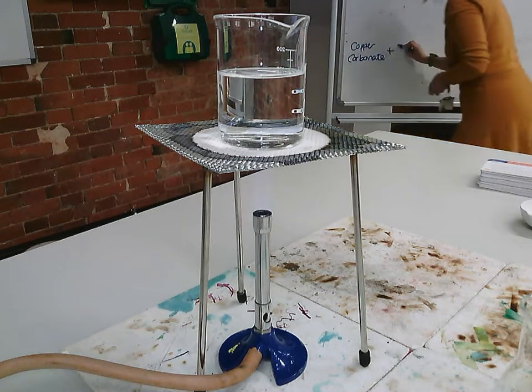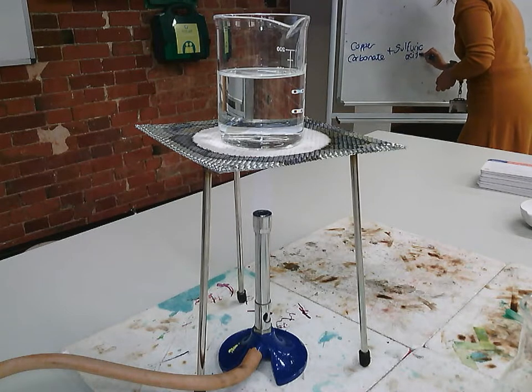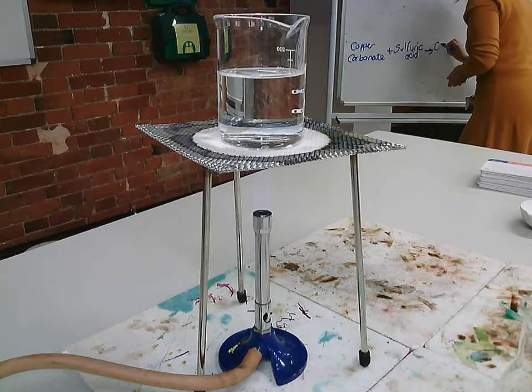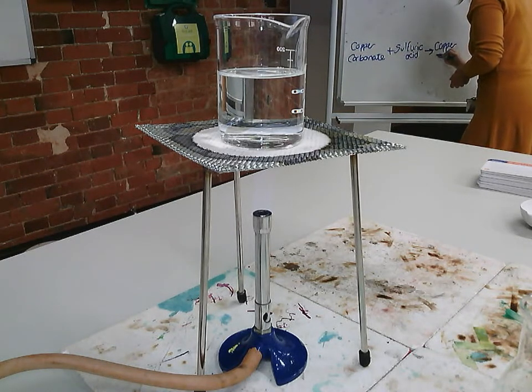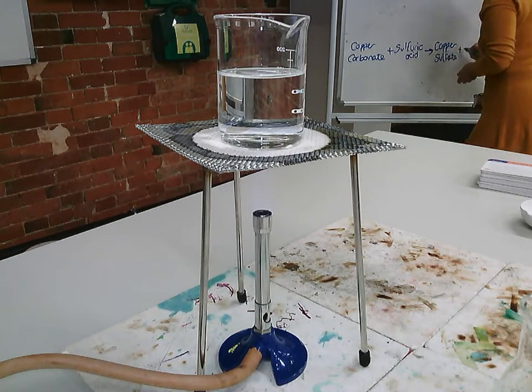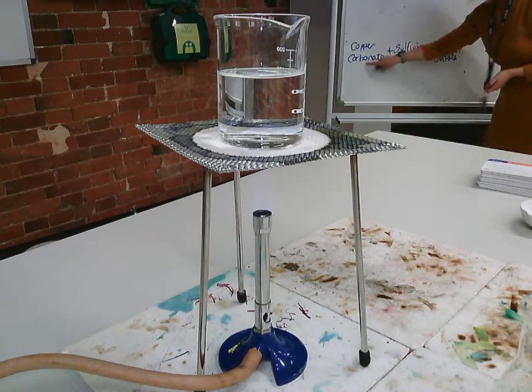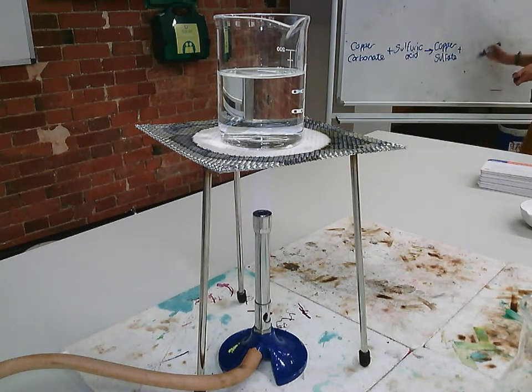Plus your sulfuric acid. And that formed copper sulfate, which is our product. It formed carbon dioxide gas from this, so carbonate. That means carbon and oxygen, so it forms carbon dioxide from that. And it also forms water.